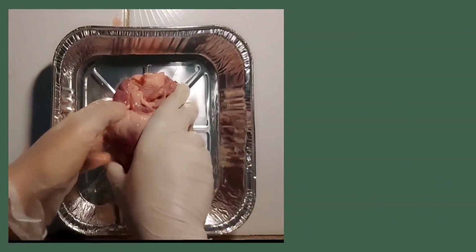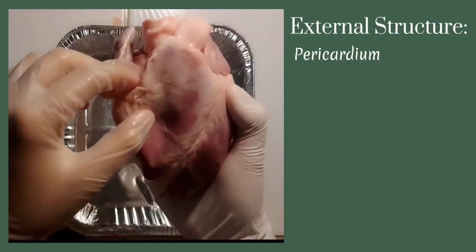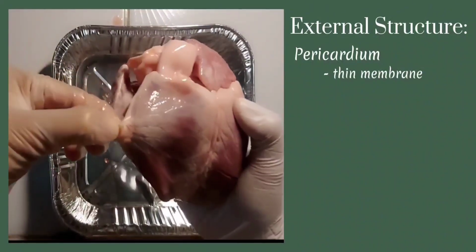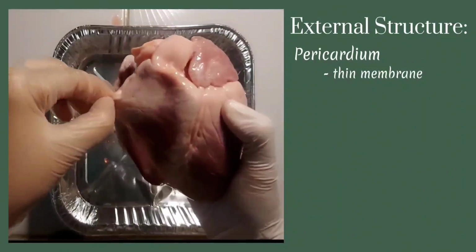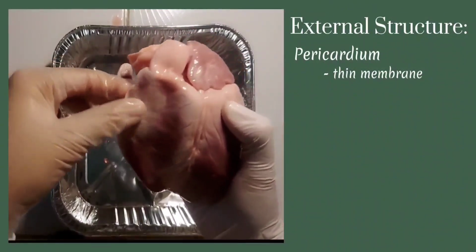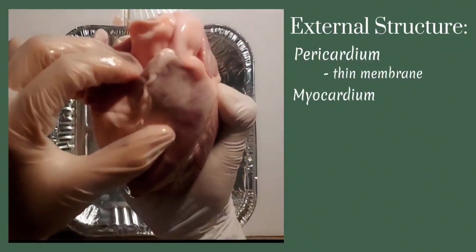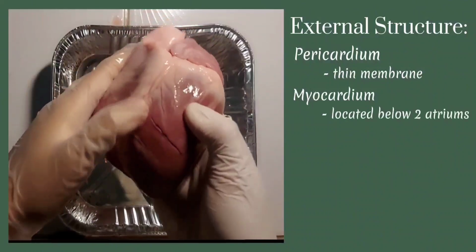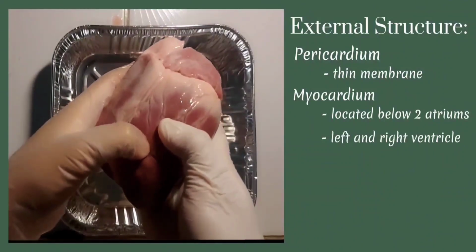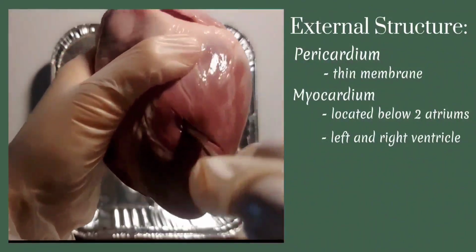Let us now examine the heart's external structure. The thin membrane, or the pericardium, is located in this part. You can kind of pull them. This thin membrane right here that I'm holding is the pericardium. When we carefully remove this thin tissue, we'll be able to see the myocardium, or what is called the muscle of the heart. This myocardium is located below the two atriums and is referred to as the left and right ventricles. We can kind of cut this part so we can see the muscle.